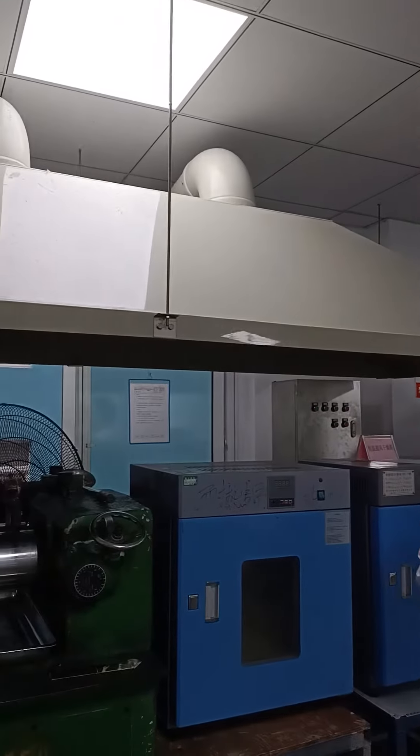Okay, that's all. This is our laboratory. We have more than 40 testing machines, so we can control the quality very well. Don't worry about the quality.